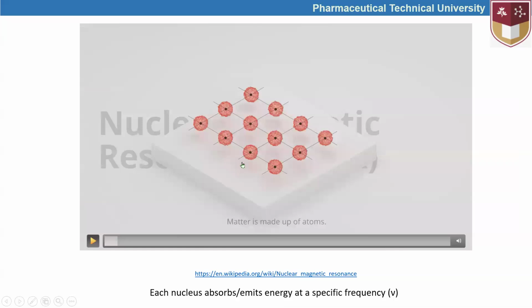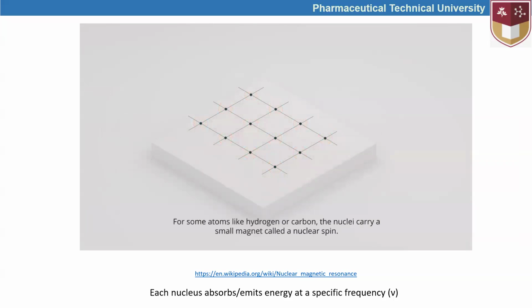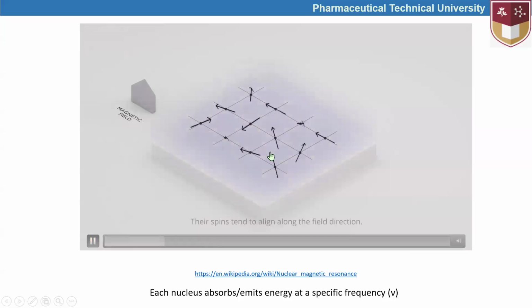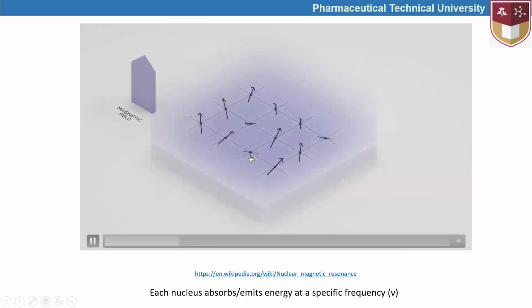Let's say here nuclei are indicated, and as we talk, nuclei have their own magnetic field, and those magnetic fields have their magnetic moment, their own direction. At their stationary state, they might have different directions and changing, let's say, tendency, but under the effect of a magnetic field, those changing magnetic fields are aligned with the external magnet, as indicated here.